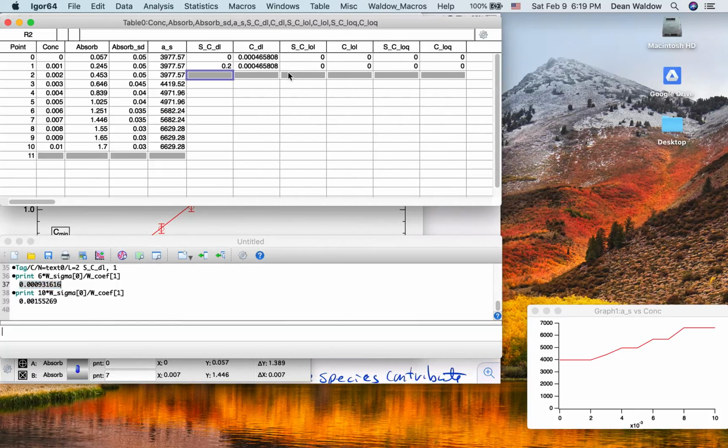And let's put it in the limit of quantitation position. So I'm going to put that in the second position. Actually, in both, and then I will use the S underscore as the signal wave.